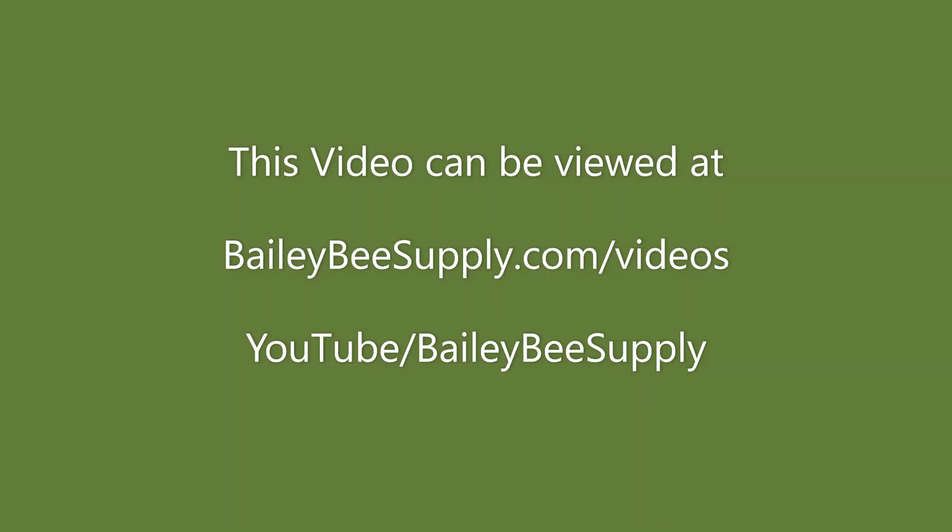So that one is ready for the next sample. Microbial growth cannot occur in a food sample or in honey if the moisture content is less than 18.7 percent so that's why we're shooting to have honey that's like 18 percent or less. A lot of times you'll find honey that's probably around 16 and a half percent and that's very acceptable you will not have any problem with growth you just keep your honey at room temperature and you'll be good to go.